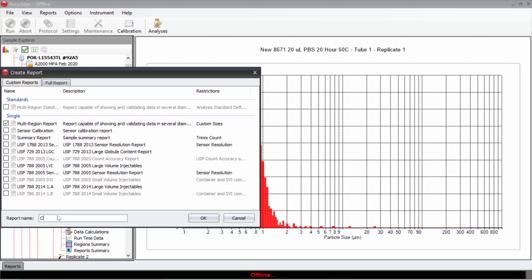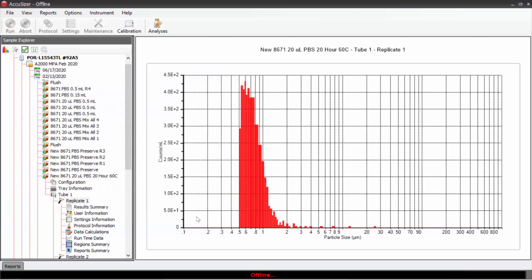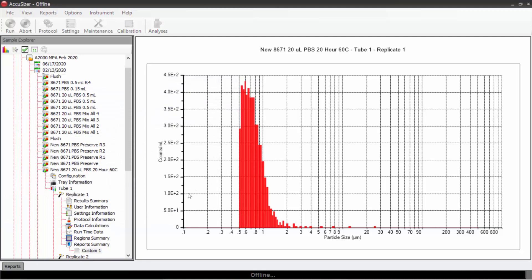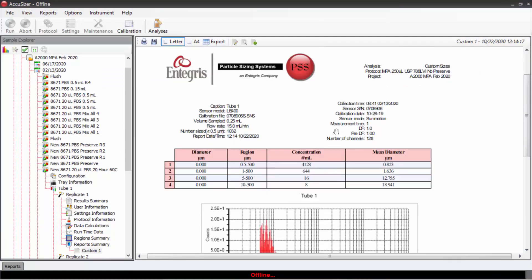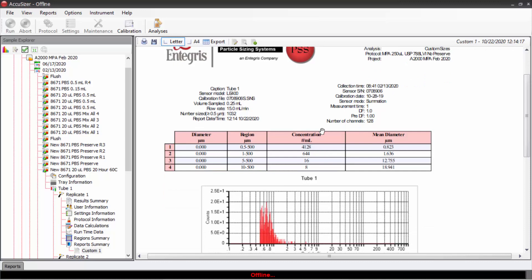I'll call this report custom one. Okay. And now it will create the report and give us the information in those selected size ranges. Here is a result looking at the number of counts per mil greater than 0.5, 1, 5 and 10 microns. And that is the first way we could use these analysis regions is to create reports and report concentration within selected size ranges.